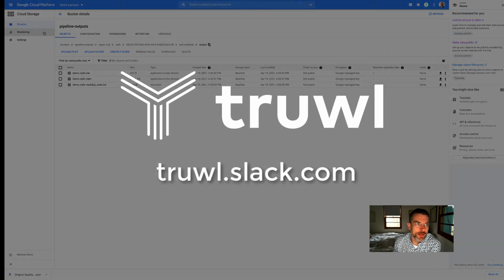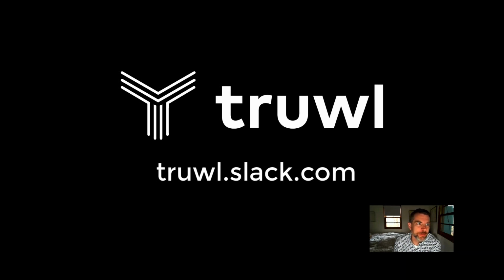Now you're probably wondering, I can run one sample, but how can I run 10,000? Well, we're going to work towards that. If you're interested in using OQFE for bulk runs, please talk to us and we'll get you going.